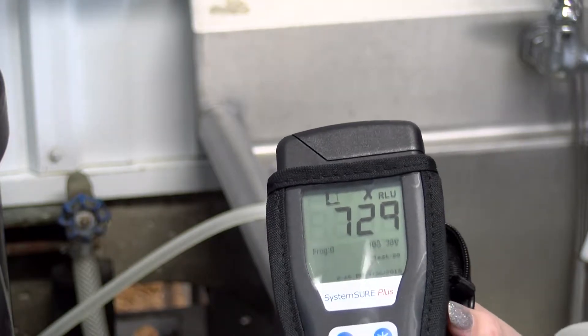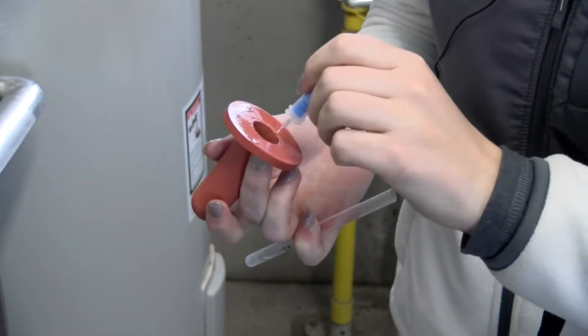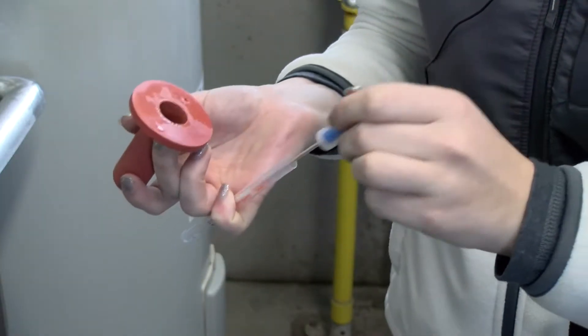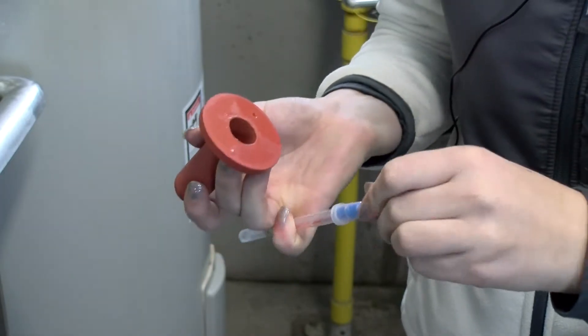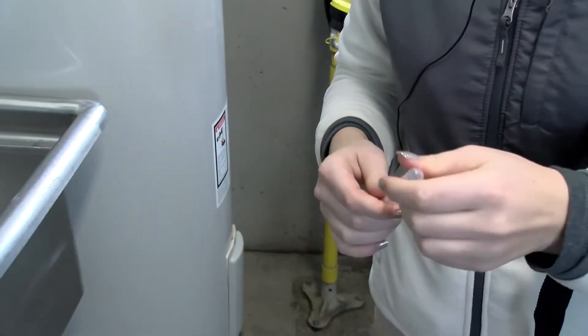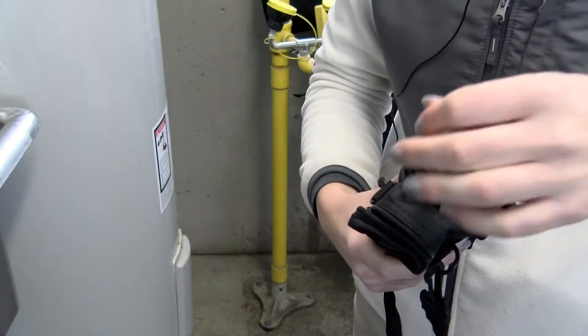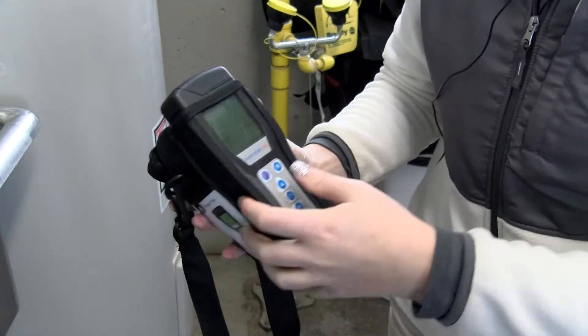The ATP meter is easy to use. First, you swab the area you want to test. Then, you snap the top of the tube to release the bioluminescence enzyme. Mix the enzyme with the swab and place it in the meter. After 15 seconds, you have your results. Both dry surfaces and wet surfaces can be tested — just use the appropriate swabs.